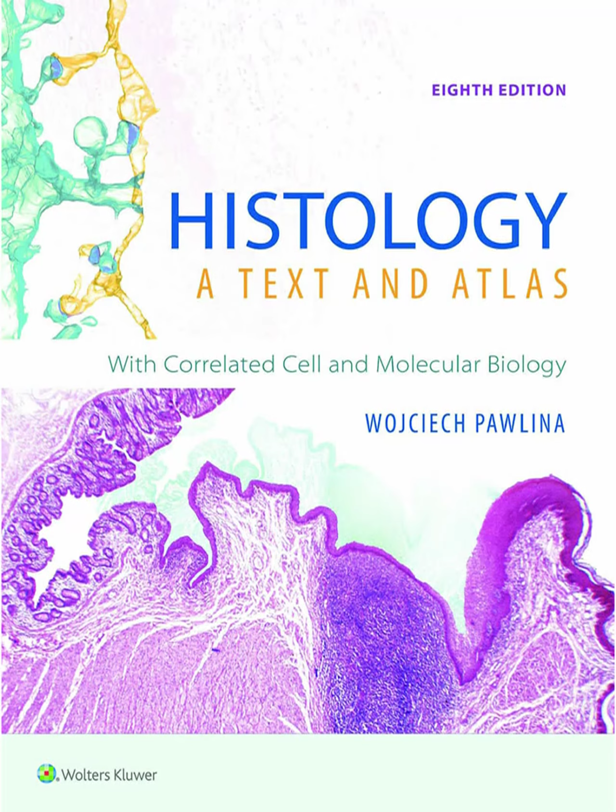And you can use this quantitatively. You mentioned something about DNA. Yes, it's Feulgen microspectrophotometry. It uses the same Schiff reagent principle, but after a specific acid hydrolysis step that only creates aldehyde groups on DNA. So it stains only DNA magenta. Correct. And because the reaction is stoichiometric, meaning the amount of color is directly proportional to the amount of DNA, you can actually use a microspectrophotometer to measure the intensity of the stain in individual nuclei and quantify the DNA.